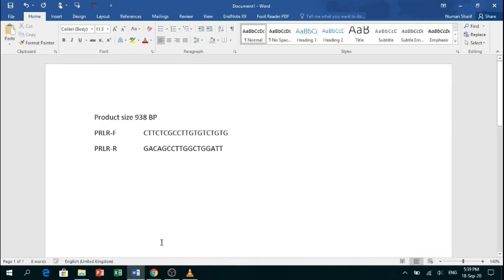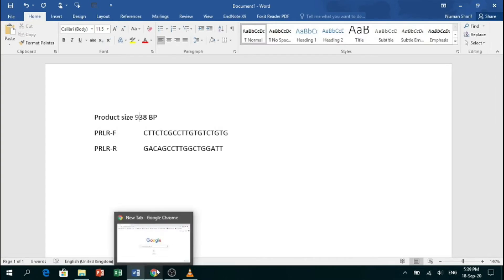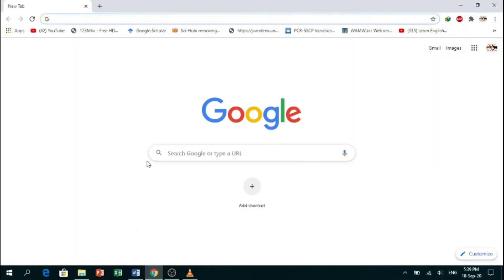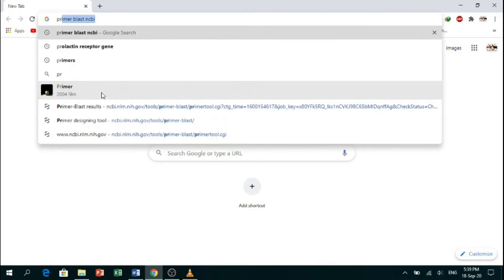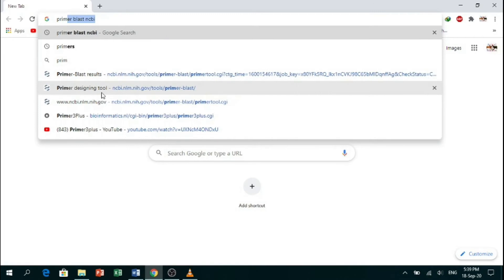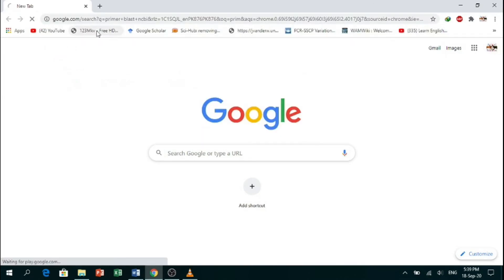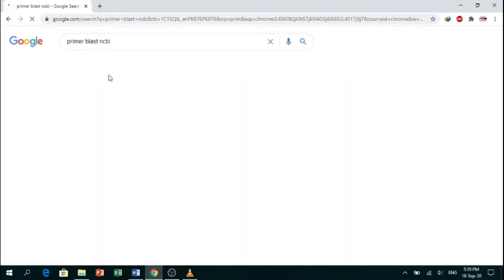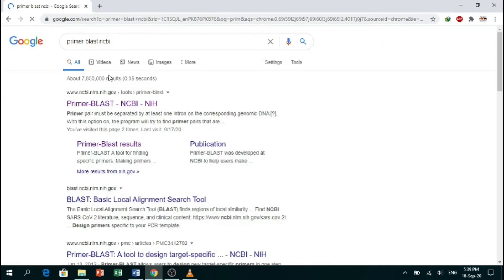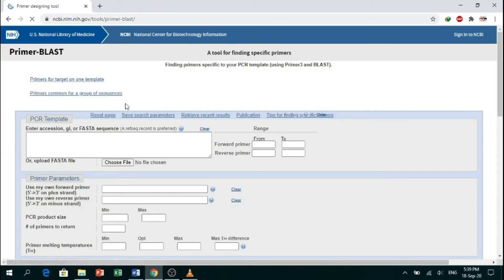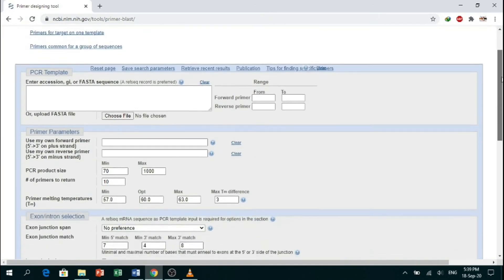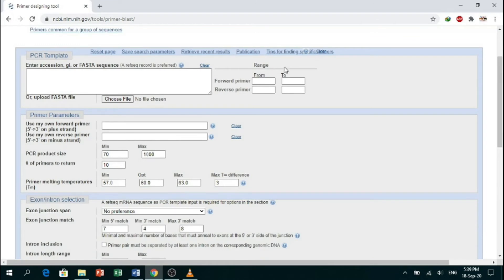Open your browser—I am using Chrome—and search 'Primer-BLAST NCBI'. Click on the first link. Here you will see primer parameters, and here is written 'use my own forward primer'.